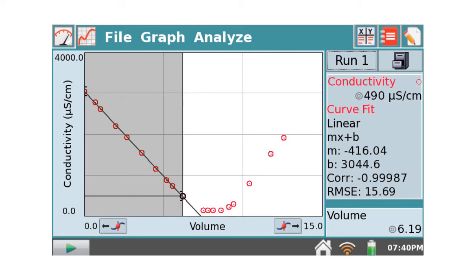It's a little bit flat here at the bottom. That's most likely because we don't have a very sensitive range down toward this bottom part. But we can pick out where the endpoint is by looking at this line that comes down along here, making a straight line plot along here, and determine where this volume is at the bottom.